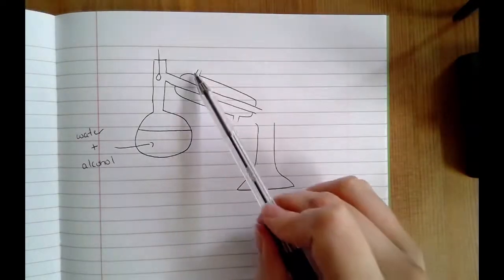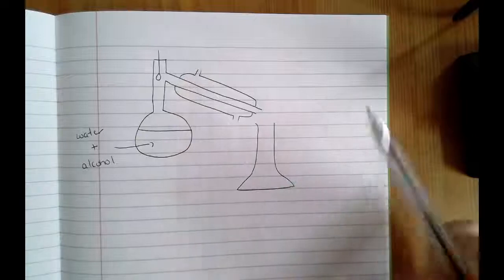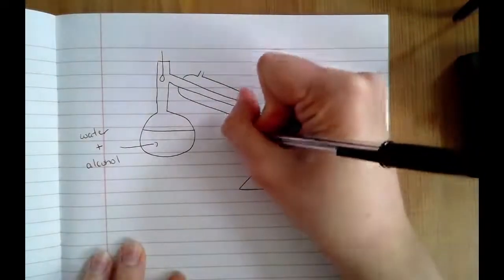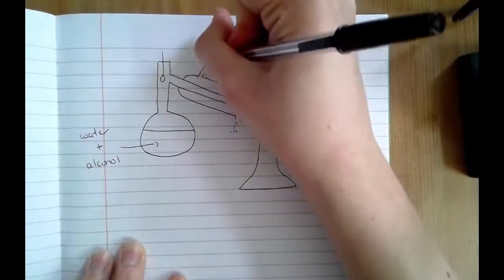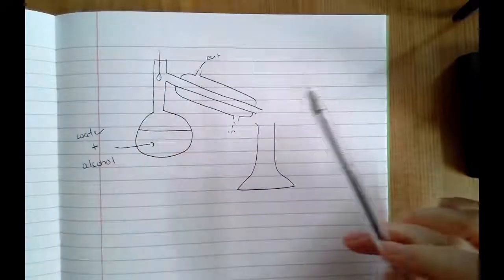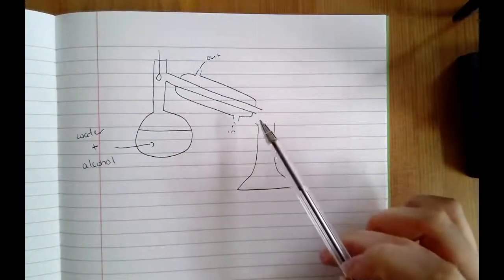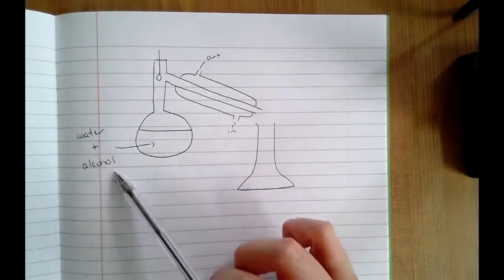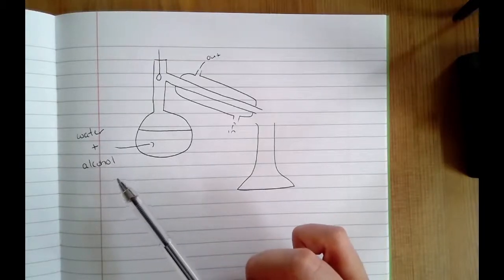You could be asked to label which way the water goes in and which way it goes out. So remember, it goes in at the bottom, water is going in, and it's coming out at the top. Remember, that's just the water from the tap. It's not actually mixing with our experiments at all. It just keeps your condenser cold. And here in my round bottom flask, I've got water and I've got alcohol.